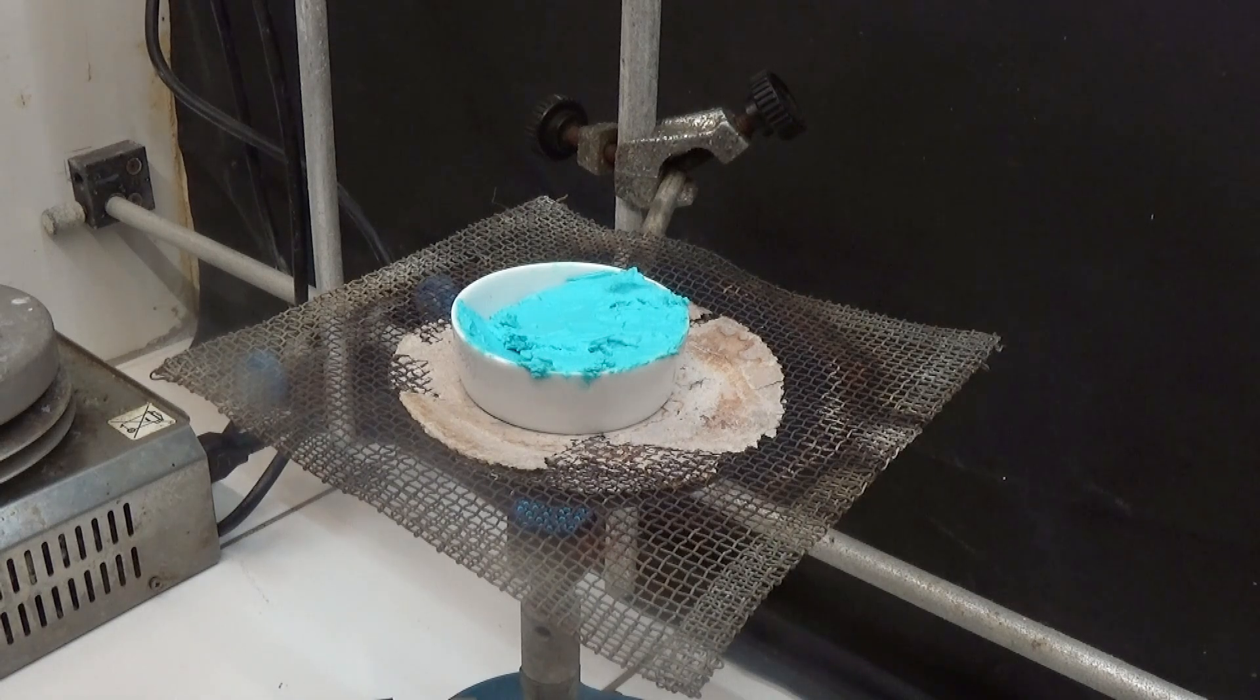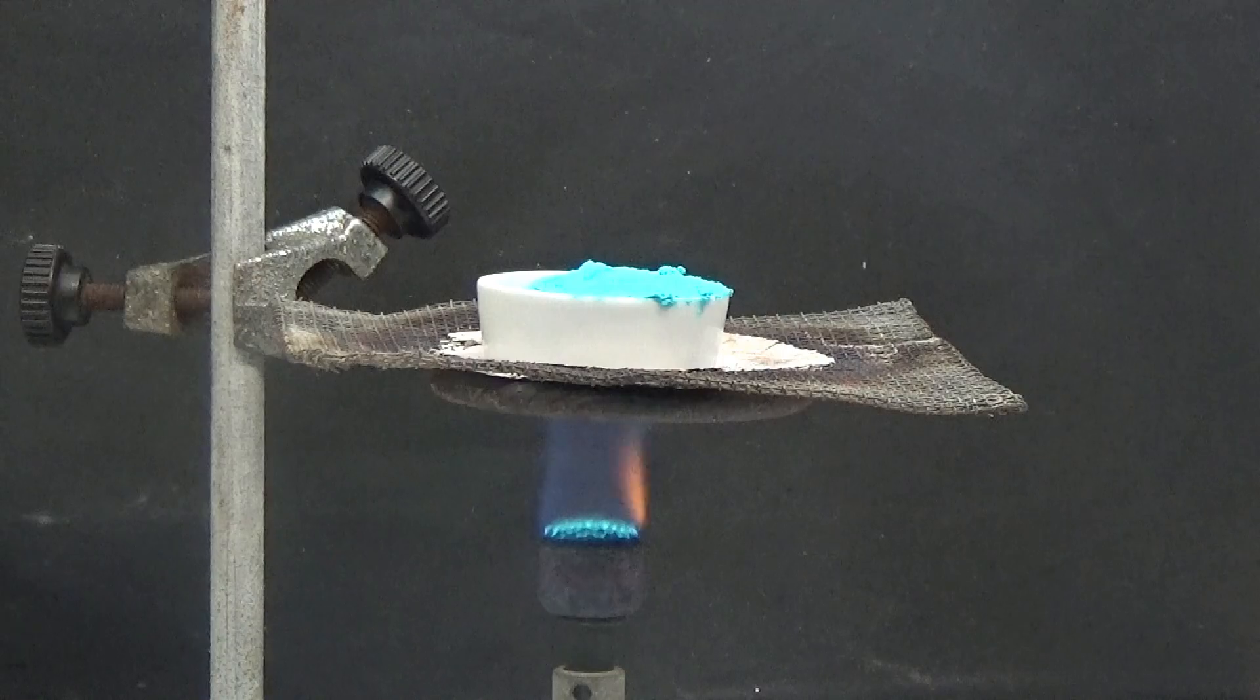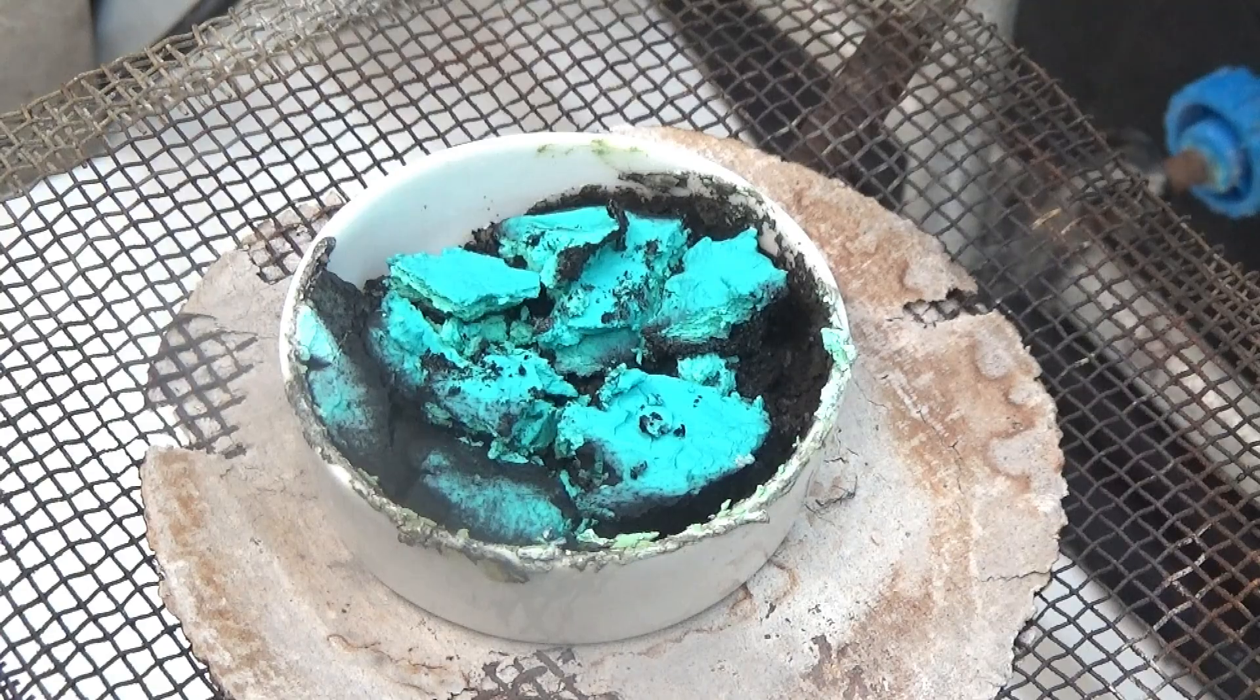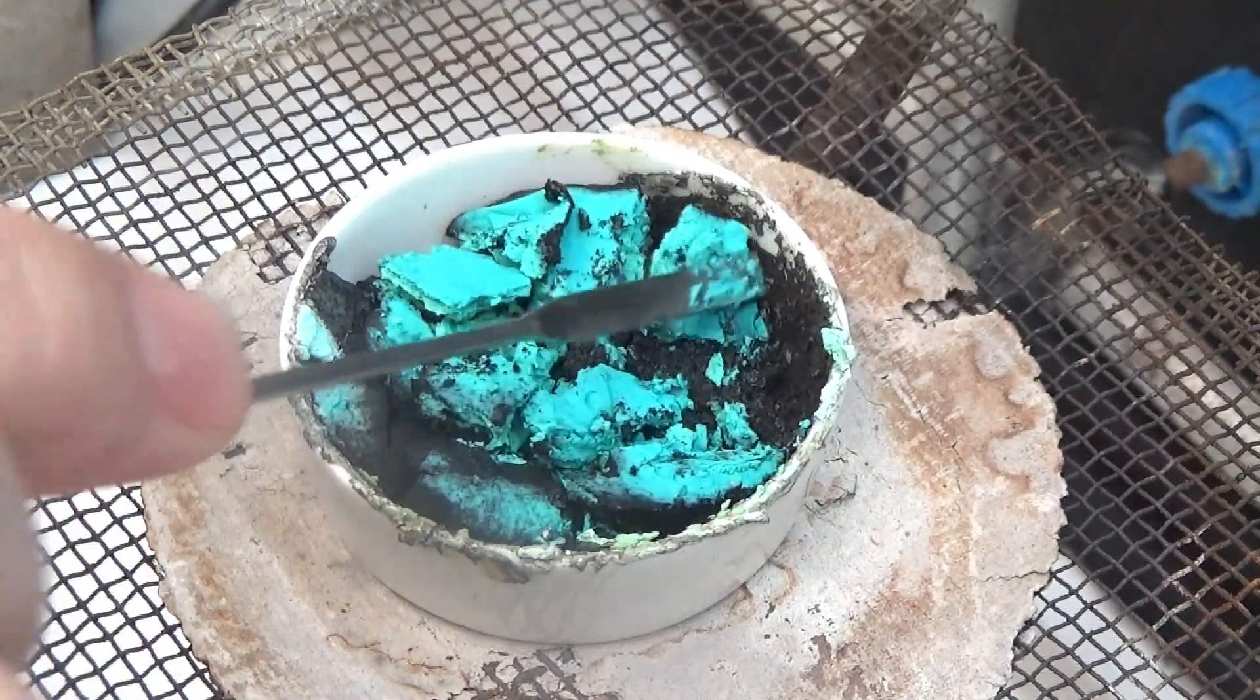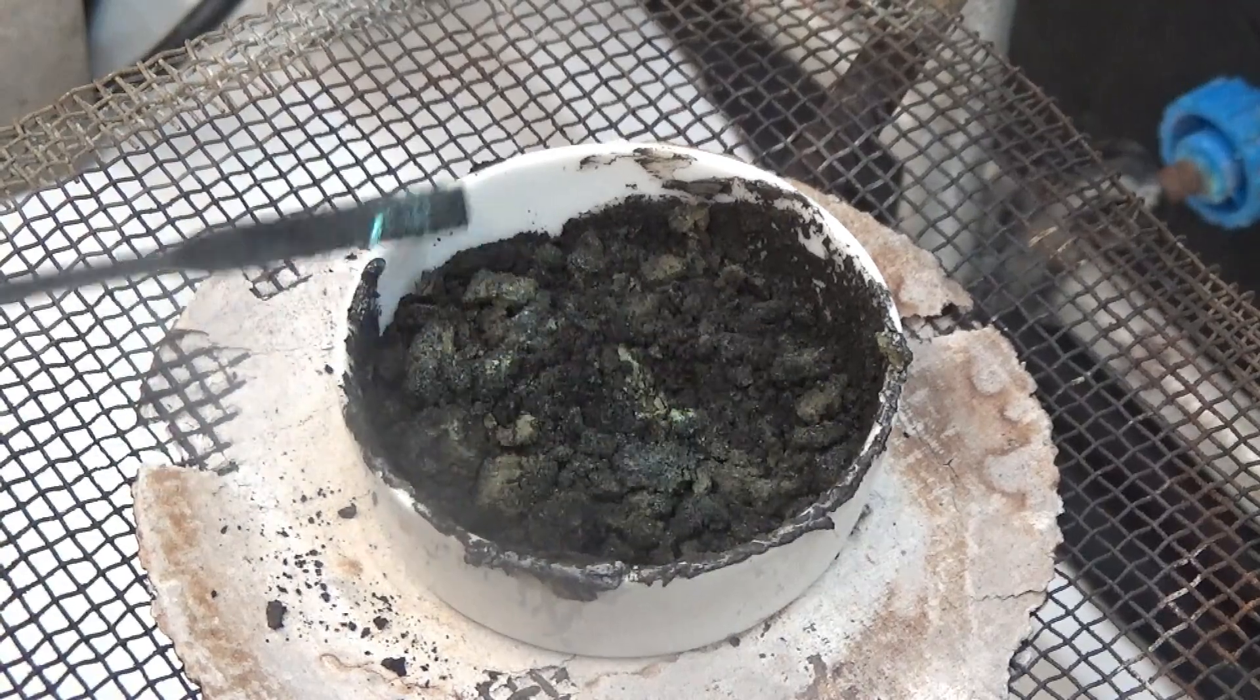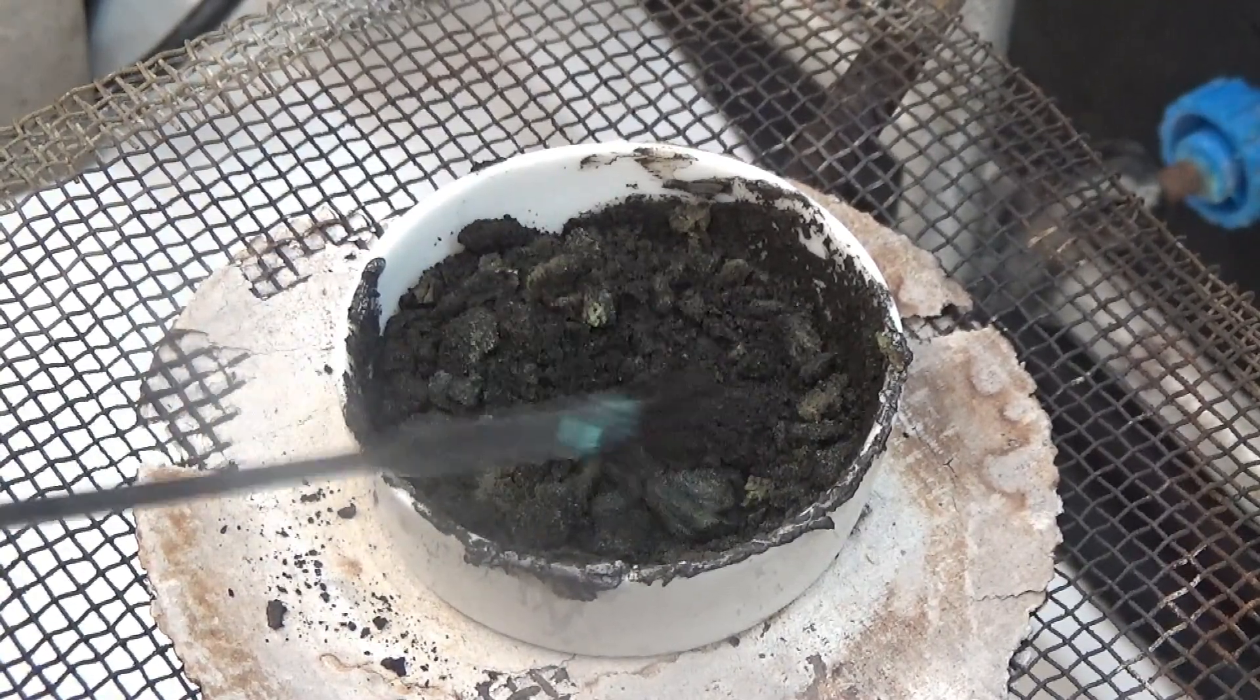The obtained carbonate is heated in a porcelain capsule with the flame of a burner, first with soft flame and then with strong flame. The color change of the carbonate from blue to black is observed. Stir with a spatula to homogenize the product. When heating the copper carbonate, carbon dioxide is released leaving the copper oxide in the capsule.